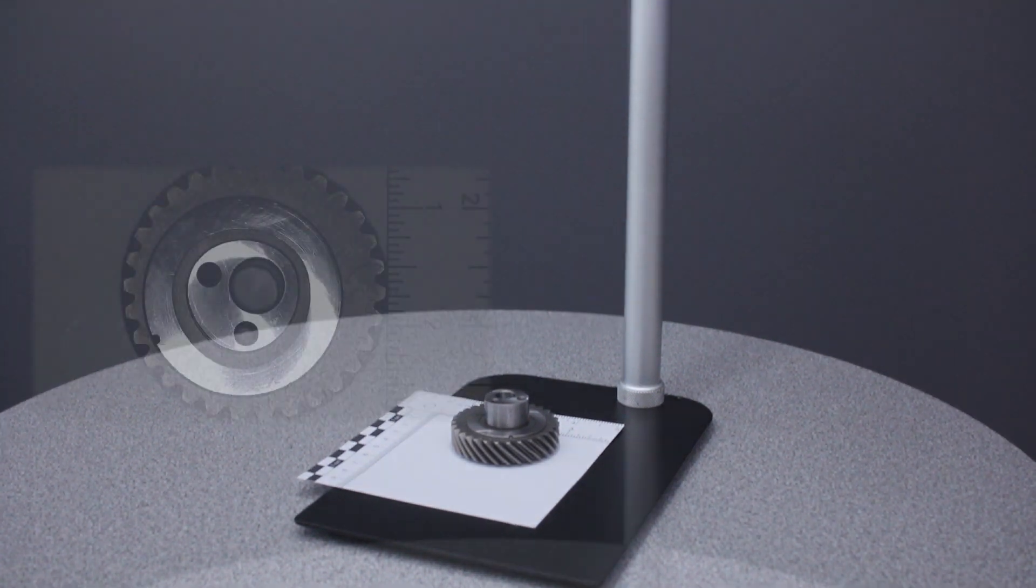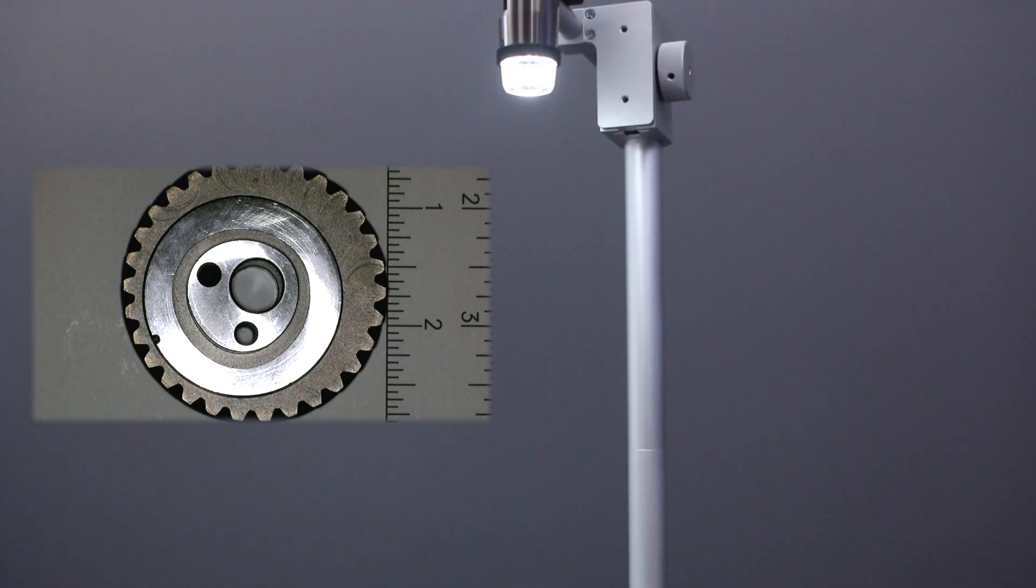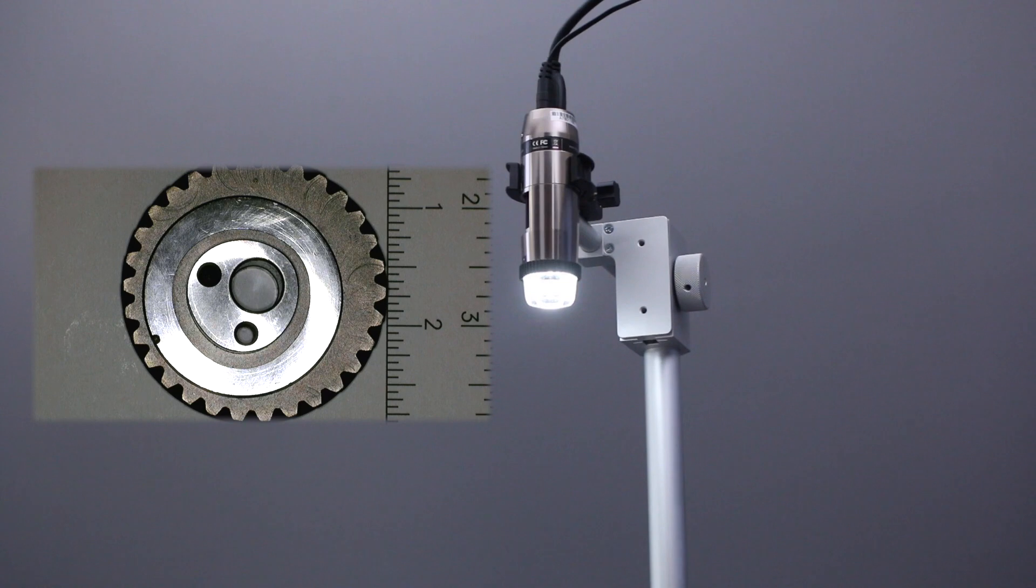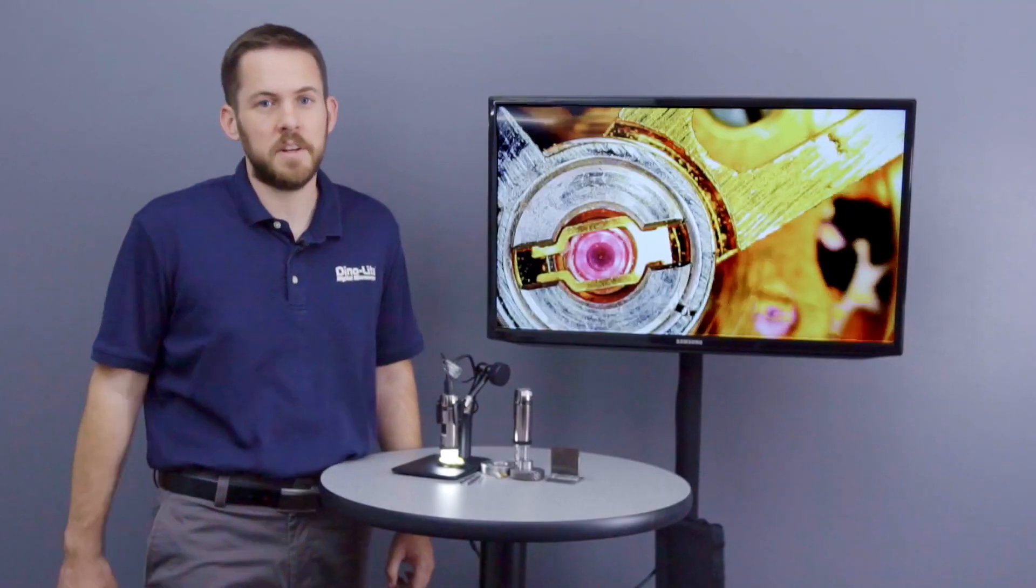A larger field of view is available at lower magnifications simply by mounting the microscope further away and adjusting the magnification dial. It can even reach infinity focus.